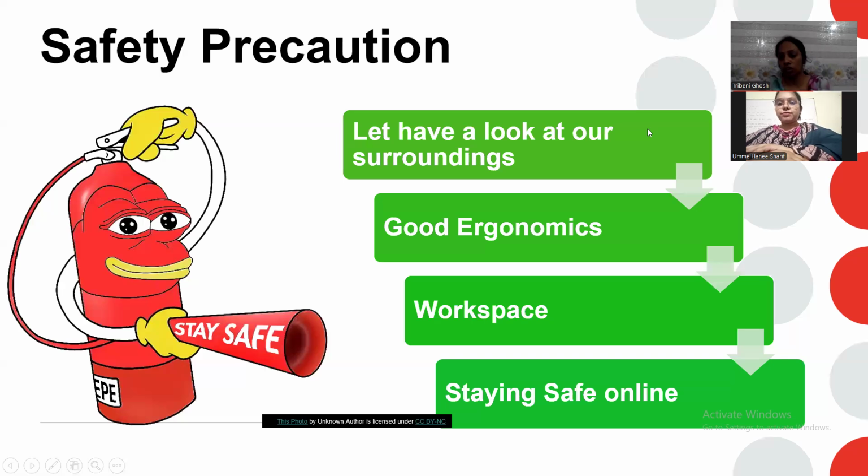As for safety precaution, please look at your surroundings. Can you trace your nearest exit? Yes, I think my environment is fine. What I was asking, can you trace your nearest exit where you can exit in case of any emergency? Oh, yes. Can you go there without trip and fall? Yes, I think there is no obstacle there, so I can easily get out of the situation if something happens.